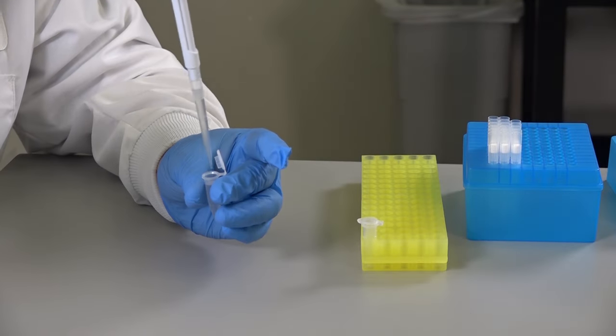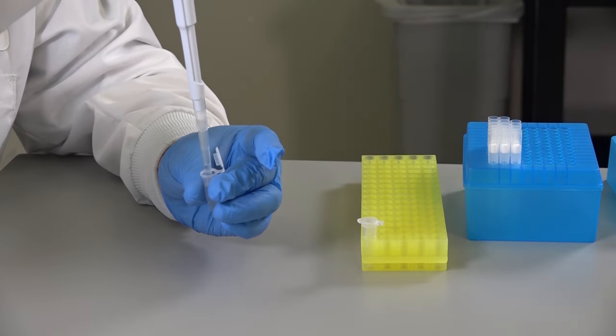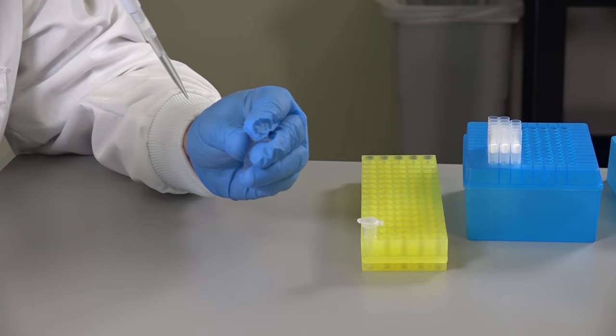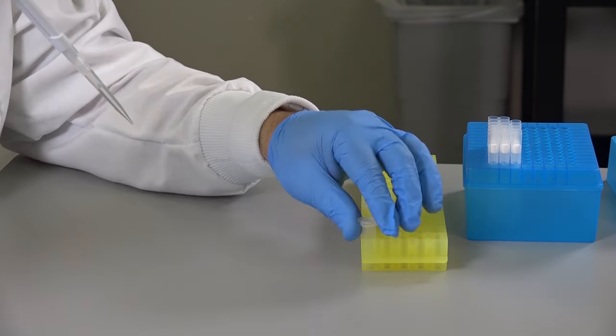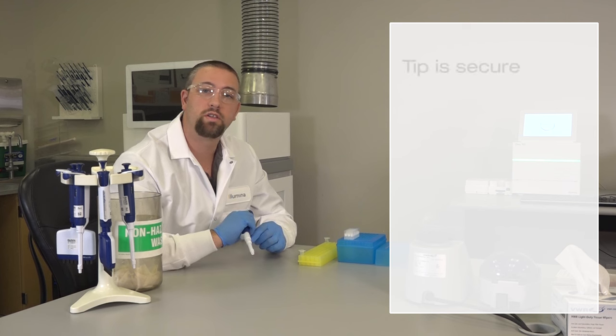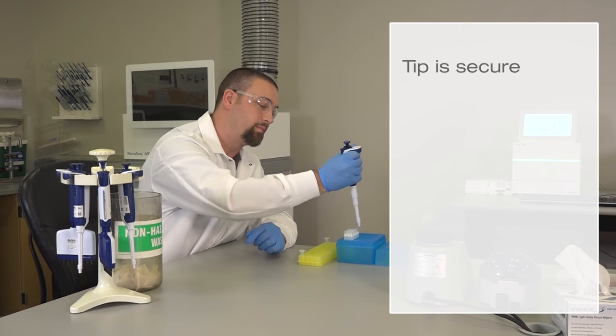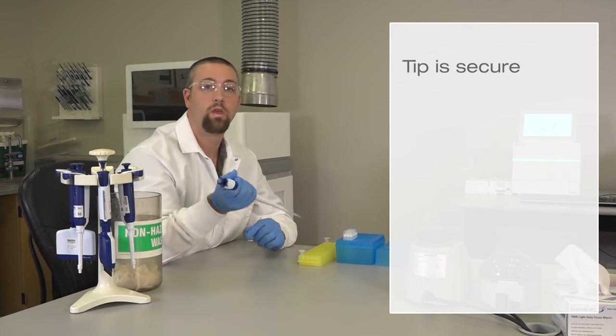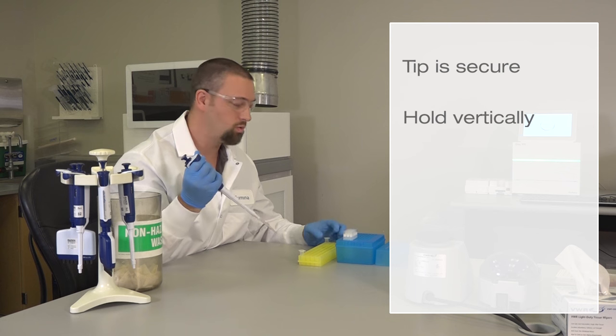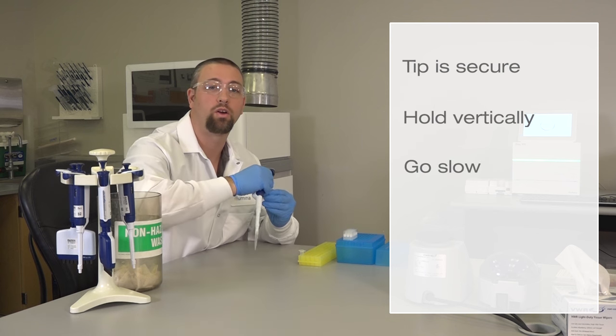It's often the simplest details that have the biggest impact, and that's definitely the case with pipetting. To avoid potential contamination while pipetting, make sure the tip is securely seated on the pipetter. Hold the pipetter vertically and go slow. Make sure you have aspirated the correct volume.